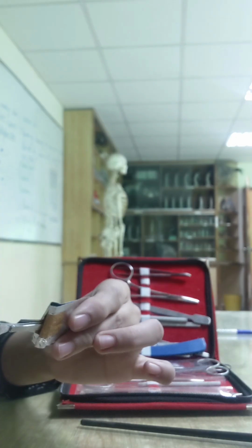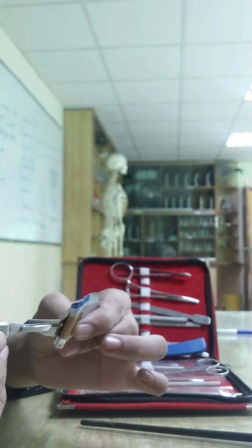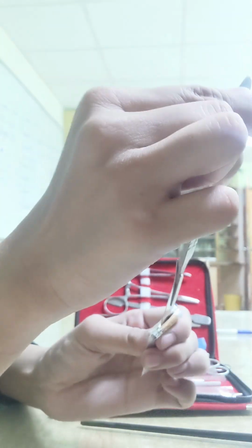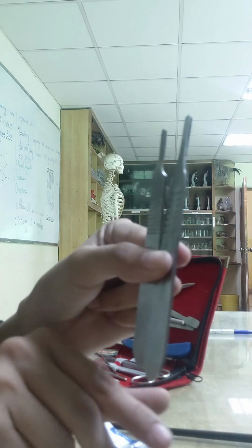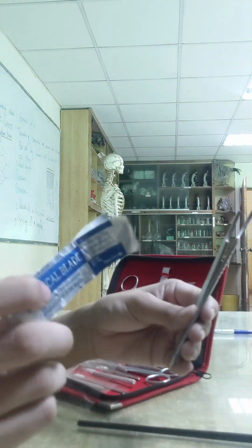How to insert the blade in the tool? Just add it carefully without touching the blade, because one, it is very sharp, and second, it's sterile. Be careful while adding this surgical blade into the tool. After adding, it will be used in surgery. Scalpel handles also vary, like number 3 or number 4. In the same way, the sterile, removable surgical blade also varies in number, like 10, 11, 15, etc. So be careful. Usually in one dissection kit, two handles are present. One is for a small size blade and one is for a large size blade for different types of surgical work.